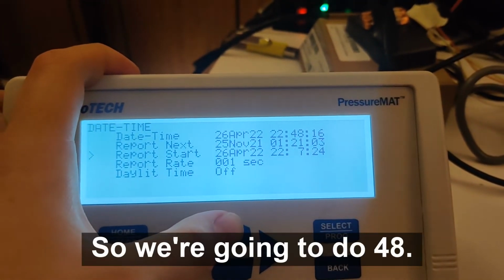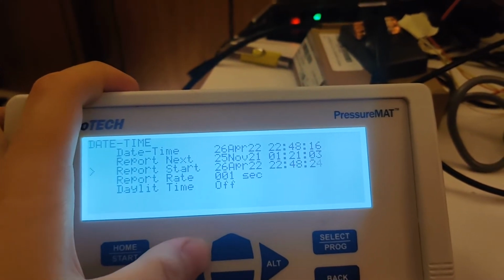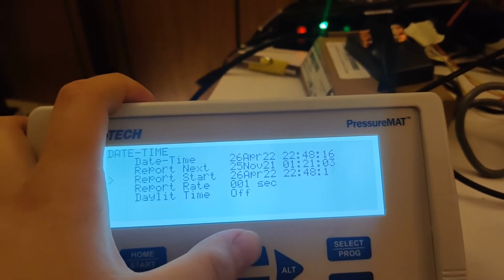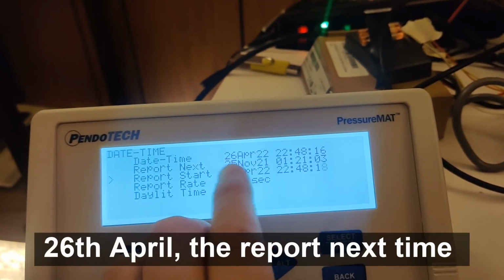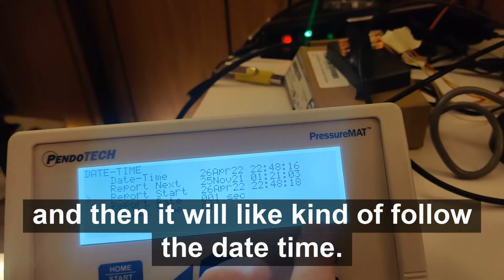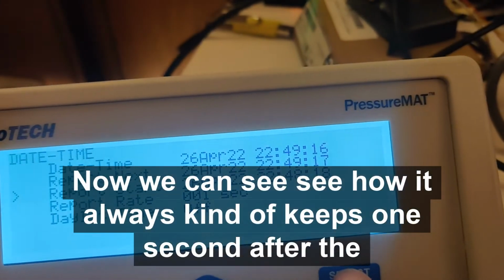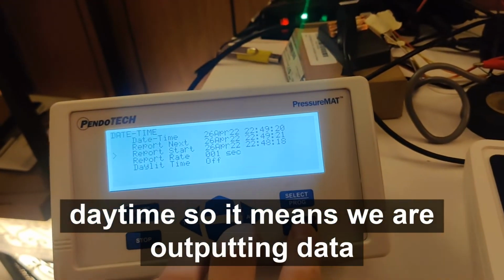Now we're going to set it slightly after the top date time there. So we're going to do 48, and we'll do 2 seconds after, so we'll do 18. Then once I hit select, you'll see that this will pop back up to the 26th of April, the report next time, and then it will kind of follow the date time. So we're going to hit select. Great, now we can see how it always kind of keeps 1 second after the date time. So that means we're outputting data.